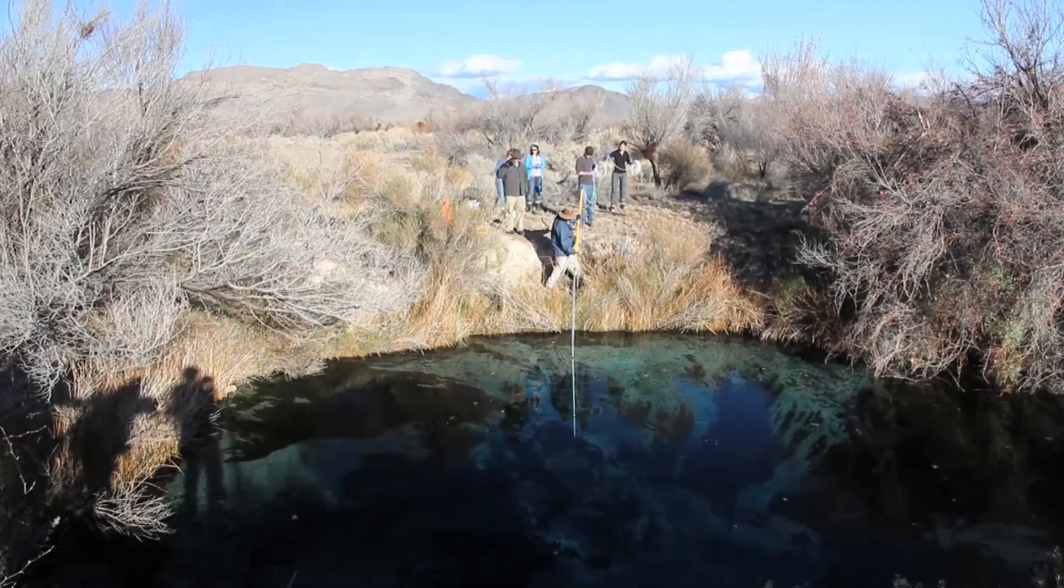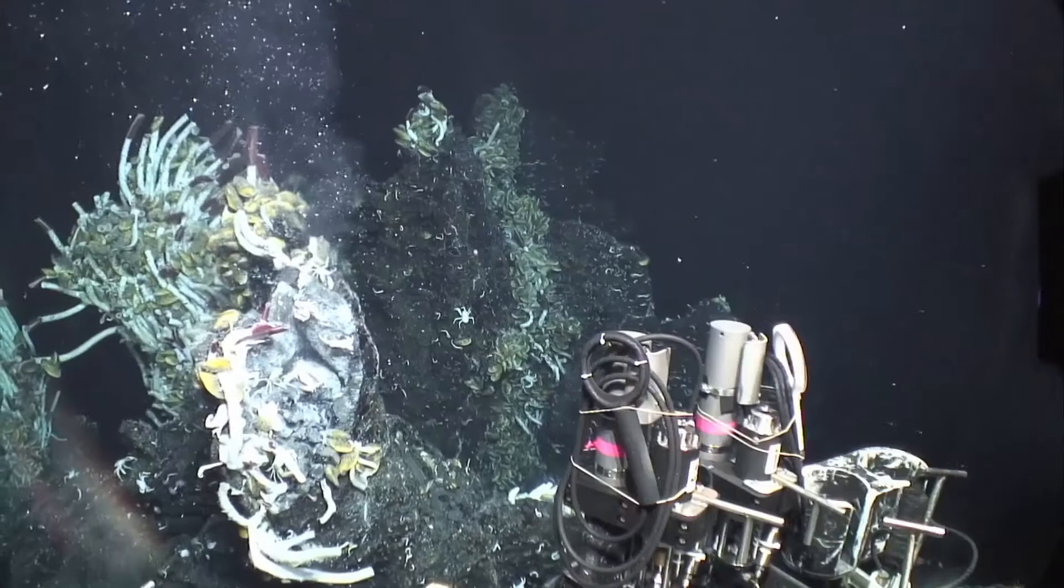SCGC workflow consists of multiple steps. First, environmental samples are collected, cryopreserved, and shipped to SCGC for further processing.